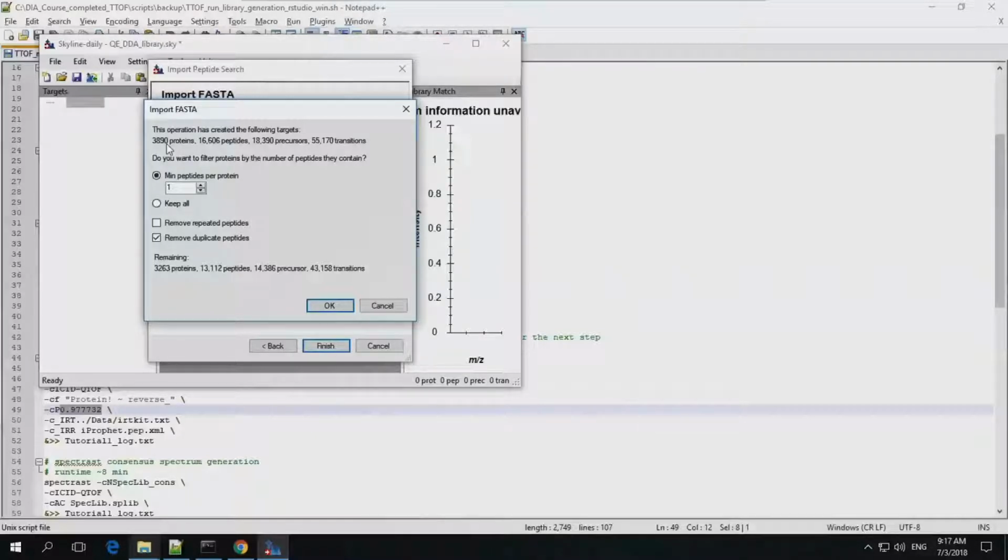So 600 proteins have only one peptide, and that peptide is duplicated, or they have multiple peptides but all of their peptides are duplicated, and we lost 3,500 peptides. So 3,500 of the peptides are not specific to the proteins of interest.